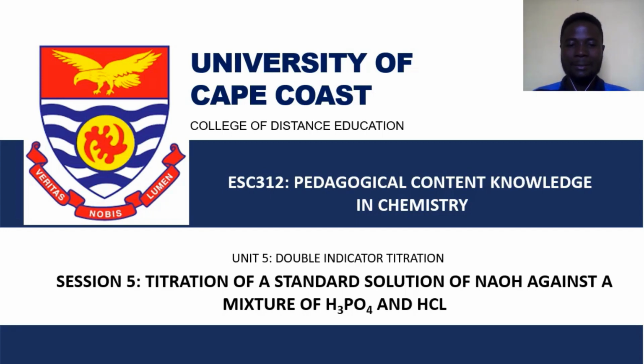The session is about titration of a standard solution of sodium hydroxide against a mixture of tetraoxophosphate 5 acid, that is phosphoric acid, and hydrochloric acid. We are going to use the continuous method to determine the concentrations of phosphoric acid and hydrochloric acid.